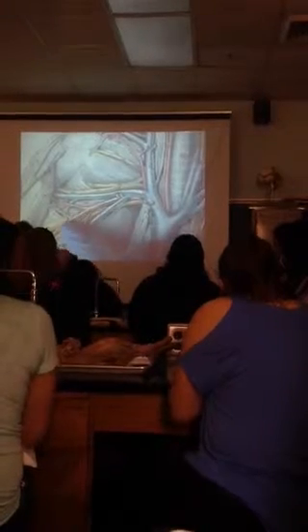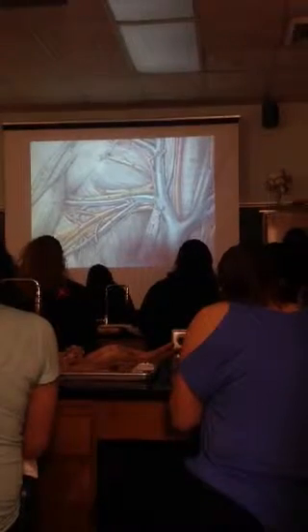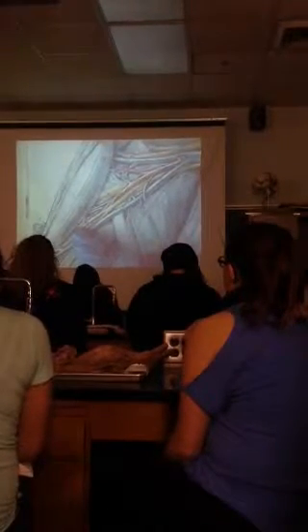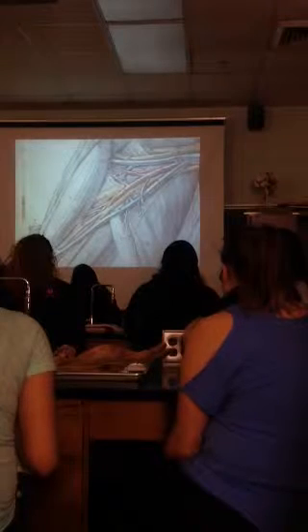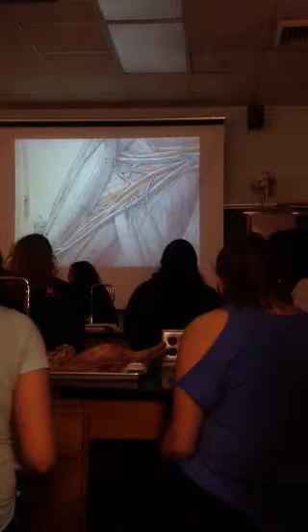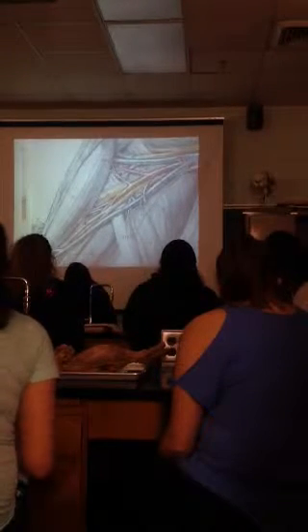Once you pass subscapular, this right here will be brachial. Brachial artery. Brachial artery is going to continue all the way down. Do you see this muscle there? Biceps, some triceps. Keep going. Number 12 is the deep brachial artery. And so deep, another word for deep is what? Anyone know? Profunda. So you could say profunda brachial there.